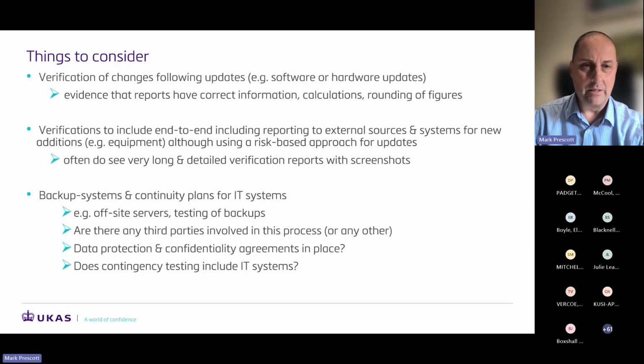I've seen these a number of times during things like change controls, and I might just turn up and see a change control that's been done, where we've updated the software to version 10. Okay, can you show me the verification report for that, please? So do make sure that you are aware of any areas where you need to do a verification.